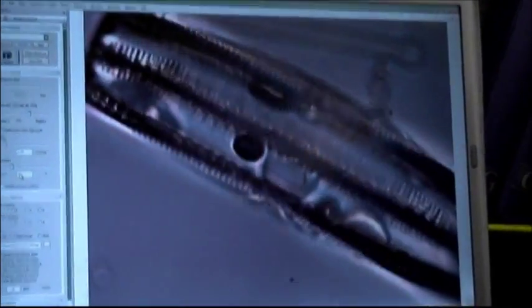How many diatoms are there? The great thing about the diatoms as indicators of condition is that there are literally thousands of species we could potentially find. And each one of those species has its own environmental preference. So we can get a lot of information.